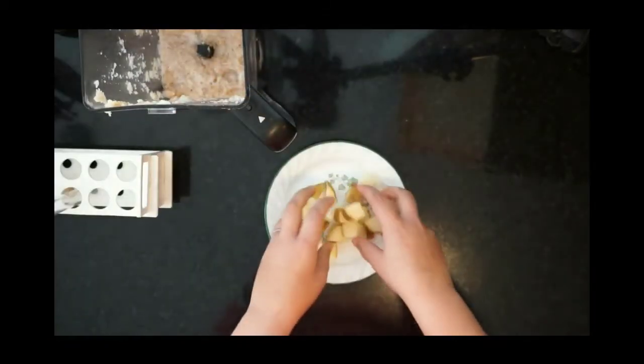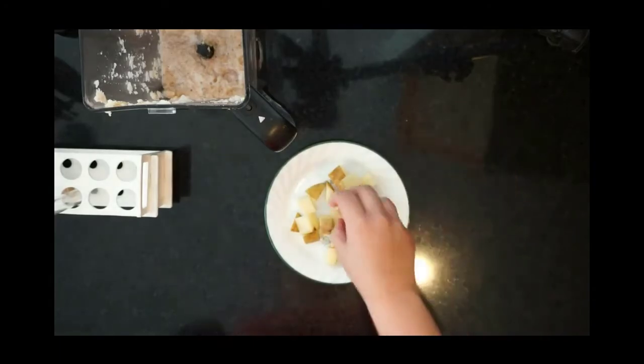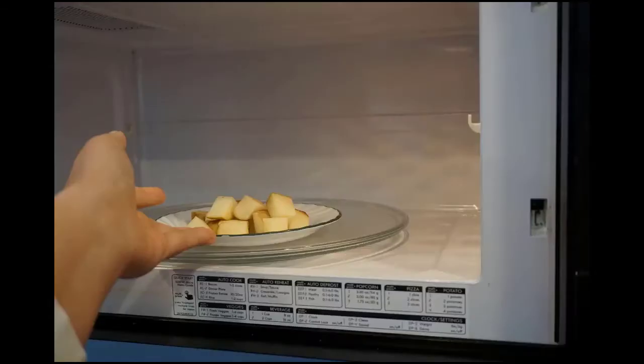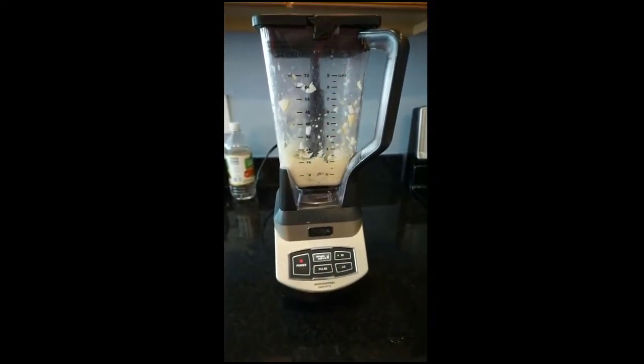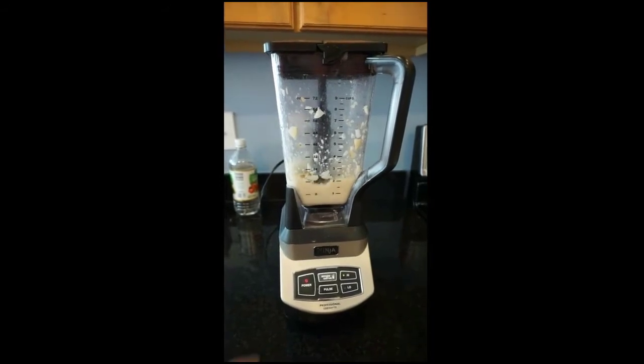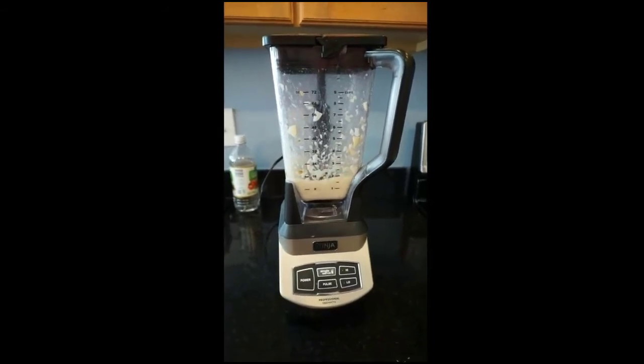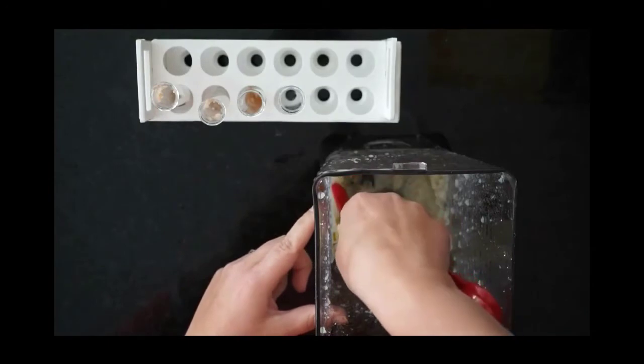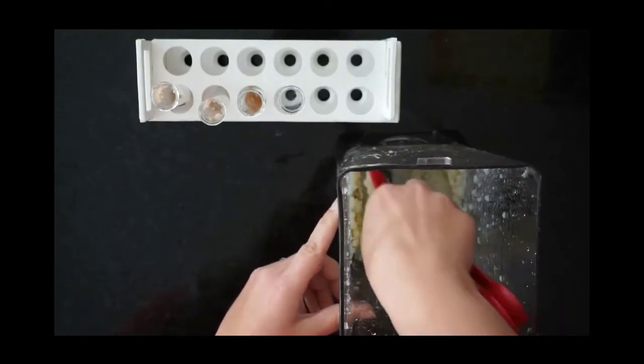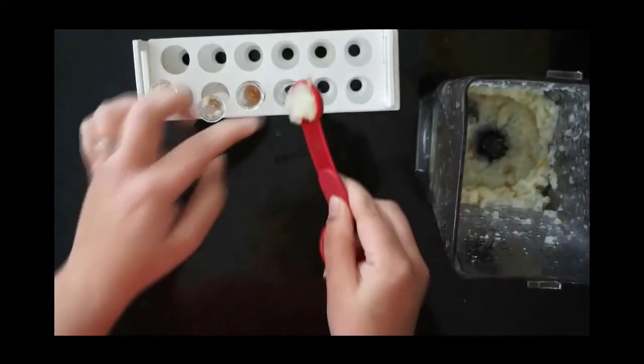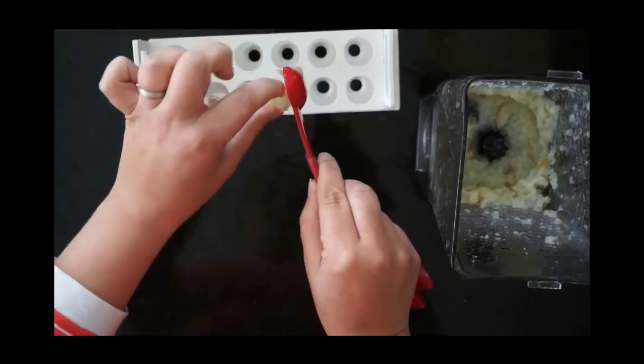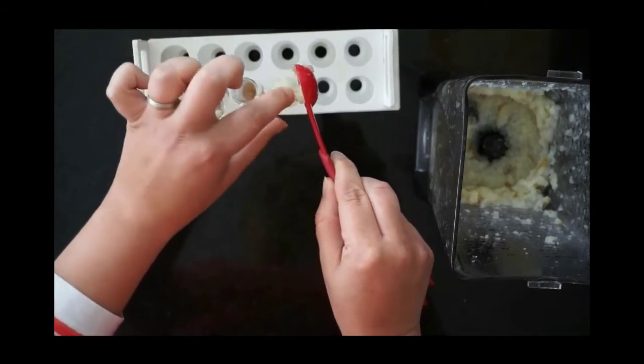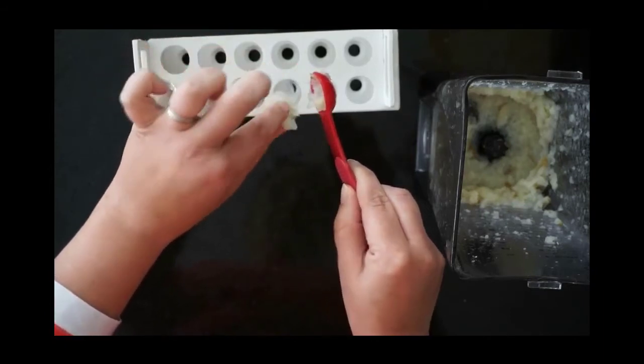Then you're going to put the other half of the potato cubes on a plate and microwave it for two to three minutes. Then blend the cooked potato and put it in tube number four or cup number four. Again, make sure that it ends up all the way on the bottom.